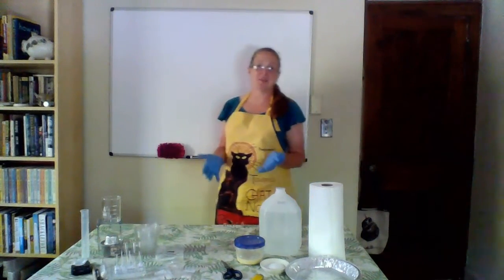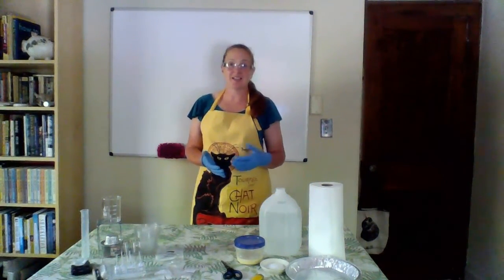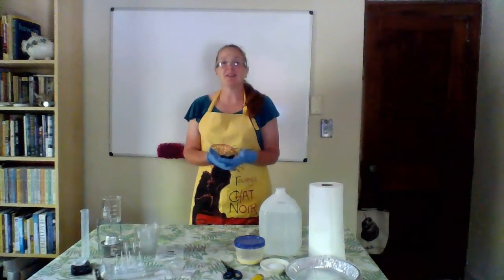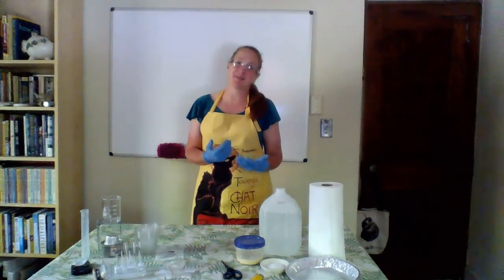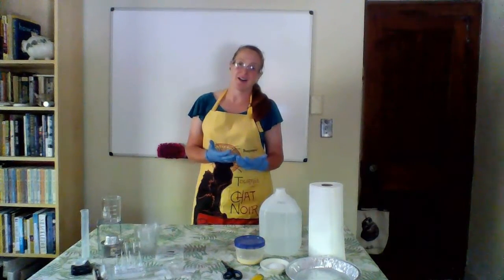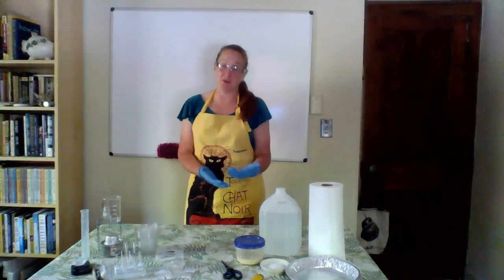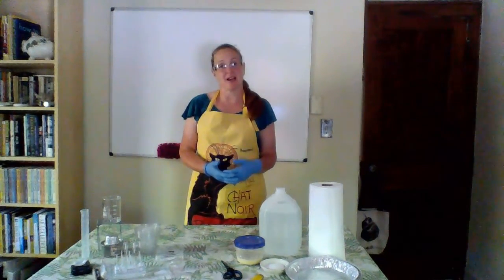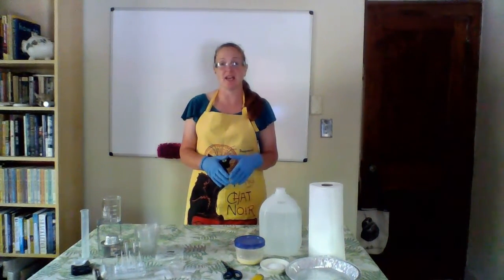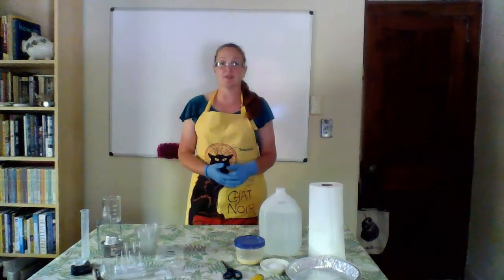The Enzyme Lab is really neat because what we're going to be able to do is to experiment with a little bit of digestion. And most of the time when we eat food, we don't really think about what happens after we enjoy how delicious it tastes and feeling full. But what will happen is our pancreas will secrete enzymes, and those enzymes are going to then be in our small intestine, and they're going to start to break down our food.